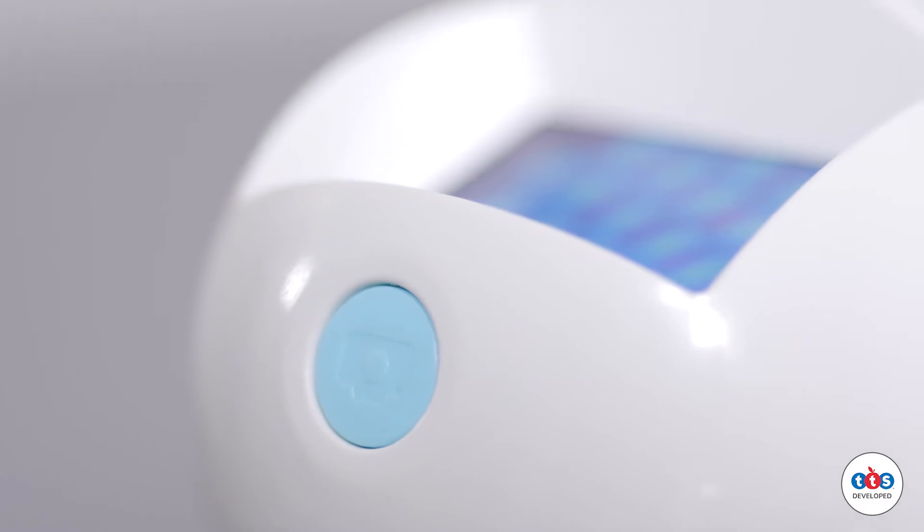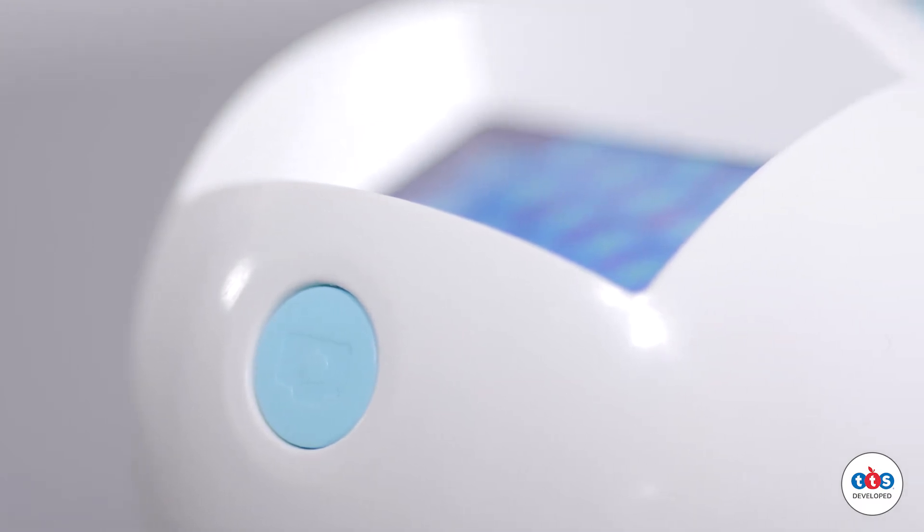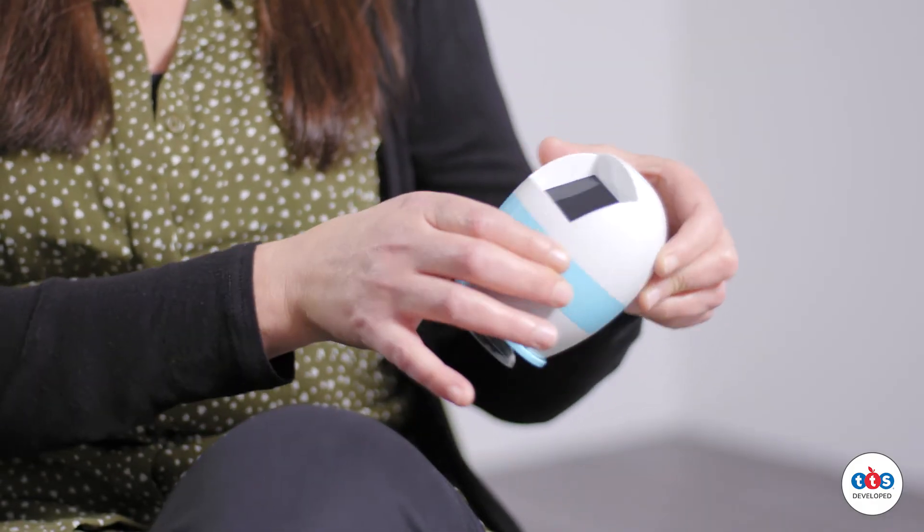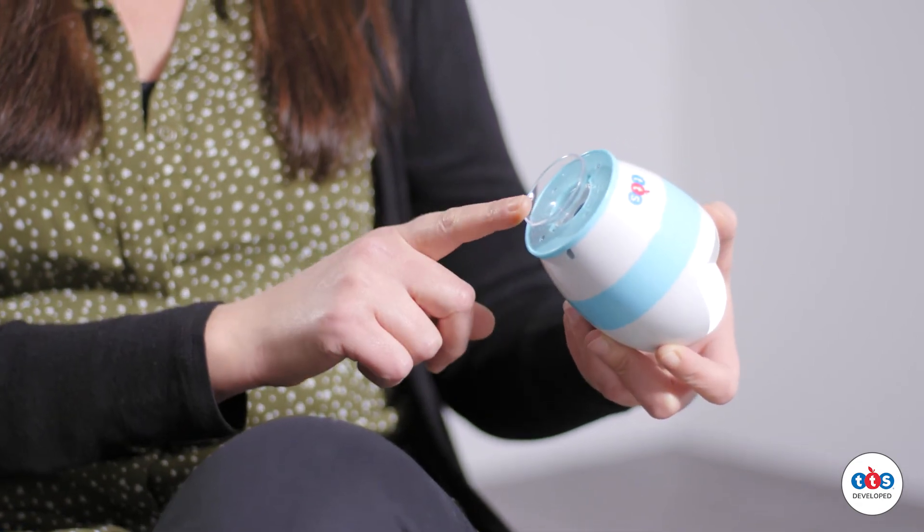The EasyScope has been designed to be suitable for small hands. When connected to a tablet, children are able to take still images just simply using this button on the top. You focus the microscope by turning the dial and the robust lens is housed at the bottom.